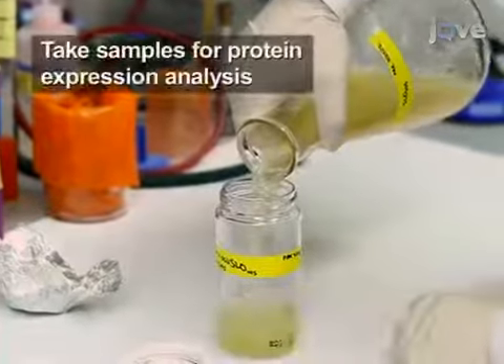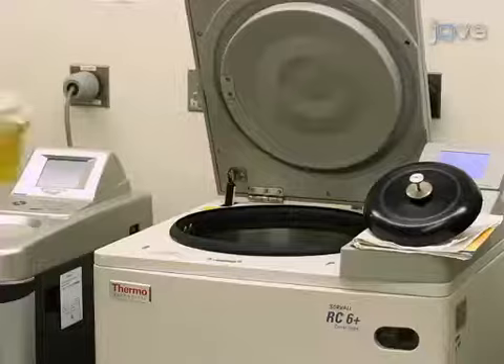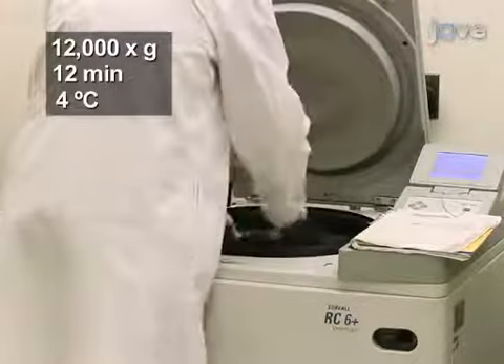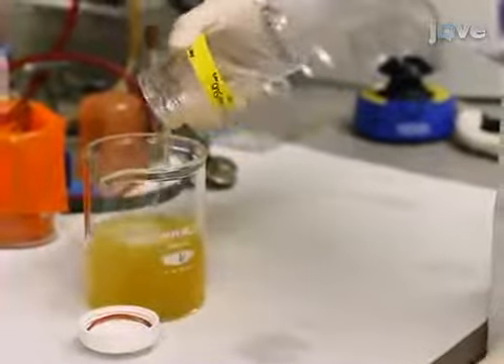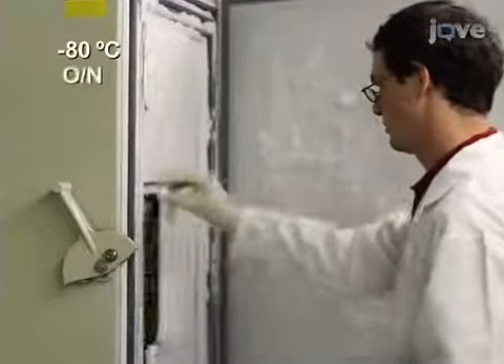Next, transfer the bacteria to a 500ml centrifuge bottle. Then, spin the culture at 12,000 times G for 12 minutes at 4 degrees Celsius. Following the spin, decant the supernatant. Store the pellet at minus 80 degrees Celsius overnight, or longer if needed.